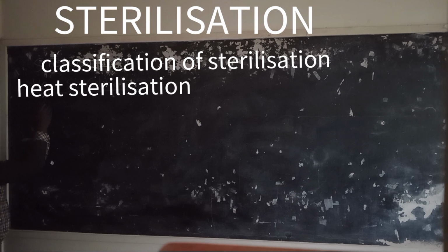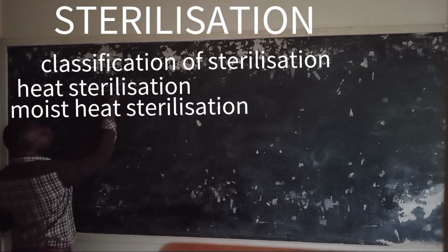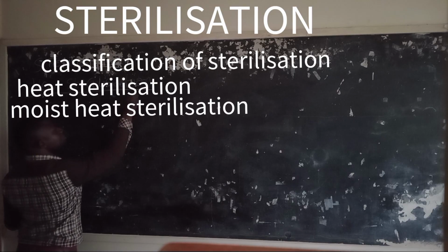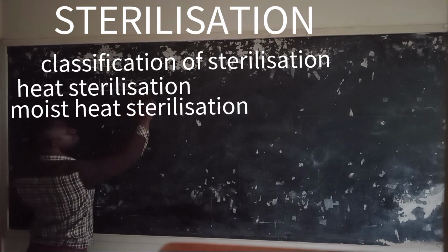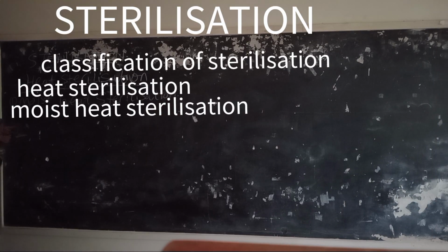So let us first look at moist heat sterilization. Under moist heat sterilization, here we usually use an autoclave.